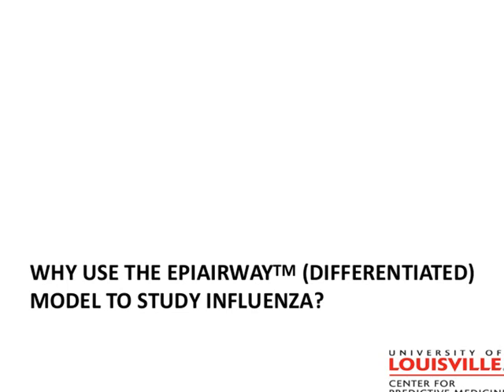And finally, because these EpiAirway tissues are at the air-liquid interface, we're able to see what signals were produced by infected epithelium, both apically and basally. This provides a more comprehensive look at what the virus is doing to the epithelium and the microenvironment established around the cells. So ultimately, this model was chosen because it closely mimics the human lung that the virus would encounter naturally.